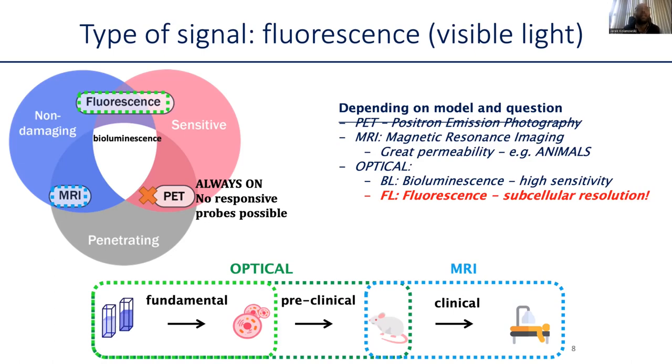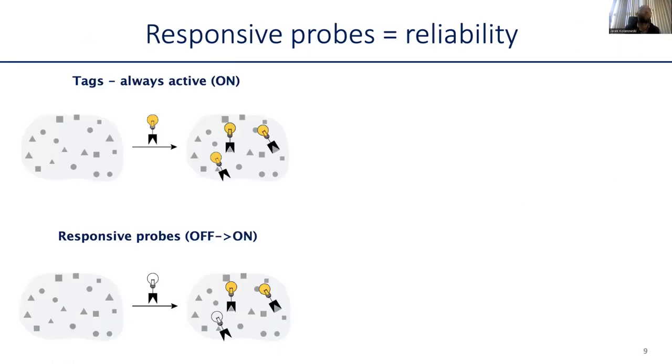It also can build upon our extensive, over 100 years history and knowledge of making compounds which are bright and shine. That allows us to use a lot of different structures, and we understand quite well the structure-activity relationship in this type of tools which generate fluorescence, and therefore it allows us to create a lot of very useful tools. And so now we talked about why fluorescence is probably one of the methods of choice, or the types of modalities of choice, for molecular imaging.